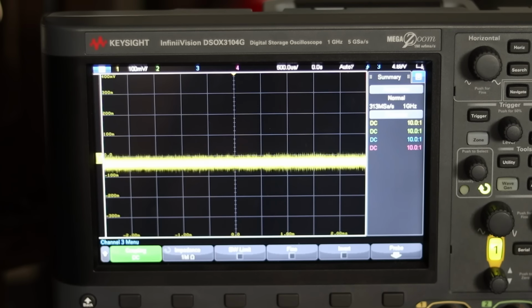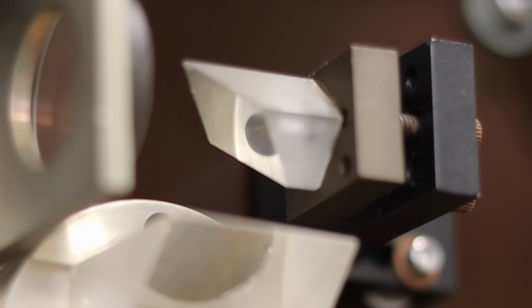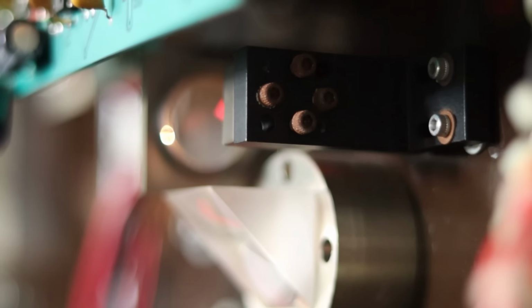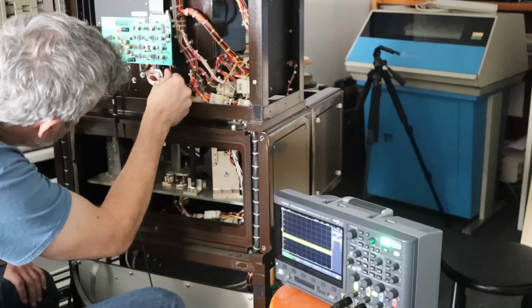Some of it is actually striking the sensor, but not enough. Since the sensor board is now properly aligned, to change the position of the white light, we actually have to adjust this little prism here that slices out the corner of the laser light in the first place. It's adjustable via these 4 little screws in a push-pull arrangement, and this was the only part of the process that really tested my patience.